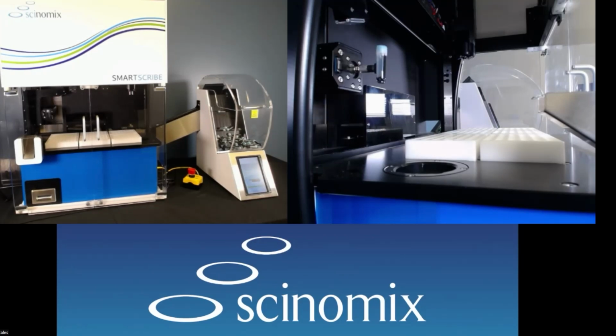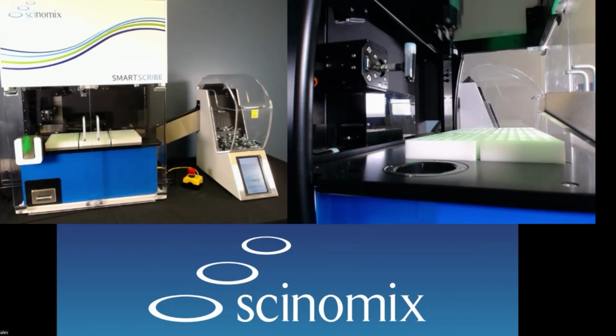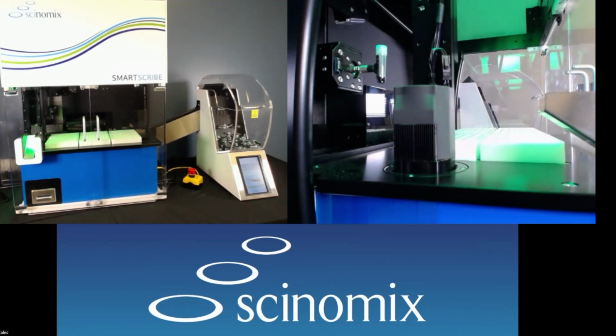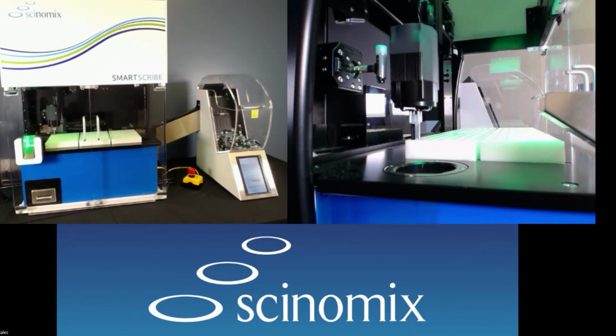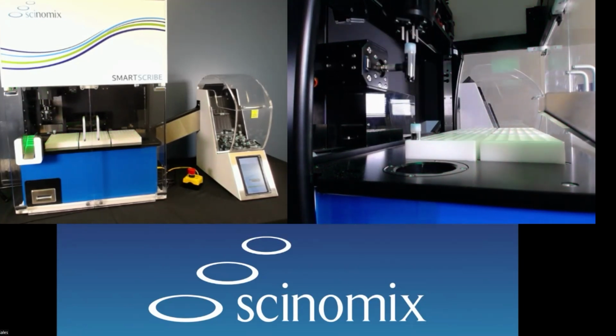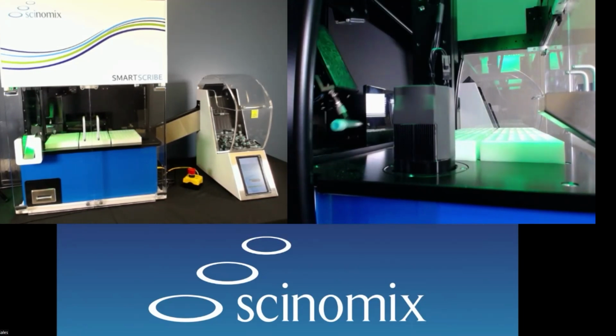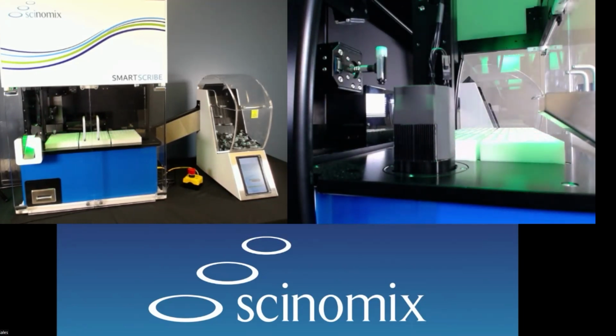Okay. And as you can see in your live view, we have the VXI presenting a tube to the gripper. The gripper has grabbed the tube and is now placing it in the laser module. What you can't see in these views, which we will show you in the next run, is the actual alignment and lasing process, so just hold on tight for that because we'll do that in the second run. So again, presenting a tube, gripper grabbing, placing in the laser module. The tube is processed in the laser module and then picked back up by the gripper and placed in the rack.